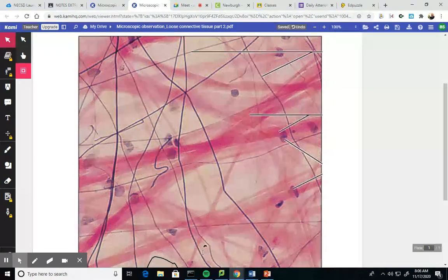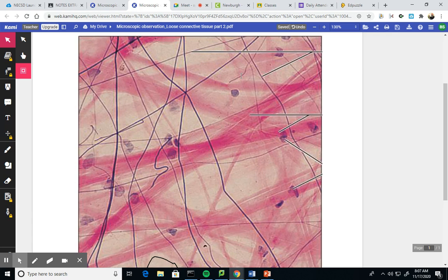I could definitely draw some going across the top, 1 here, 2 here. And then I could do a big X here. Looks like 3 or 4 and an X. And then a couple on the bottom. And then I have some thinner ones going in different directions. It doesn't have to be perfect.